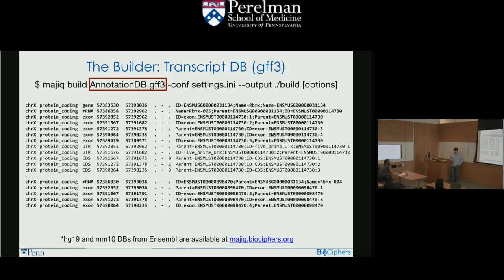If you have a strand-specific library preparation and there's some overlap, you should be able to differentiate which came from the sense and the antisense strand. But MAJIQ doesn't really have problems with overlapping transcripts, given that you've done strand-specific analysis. You should have another gene entry for the antisense strand, in theory, that defines it slightly differently.